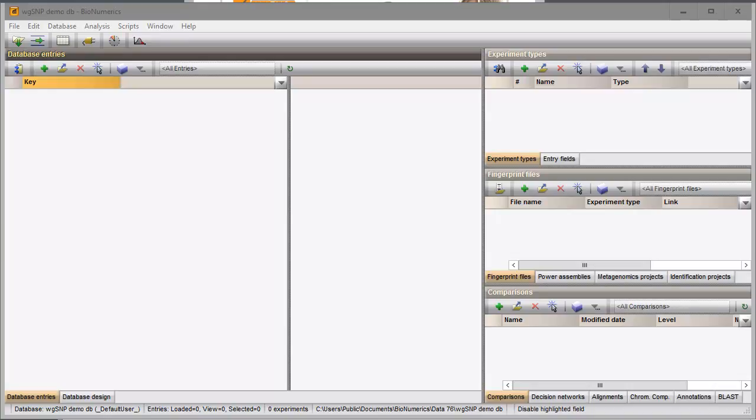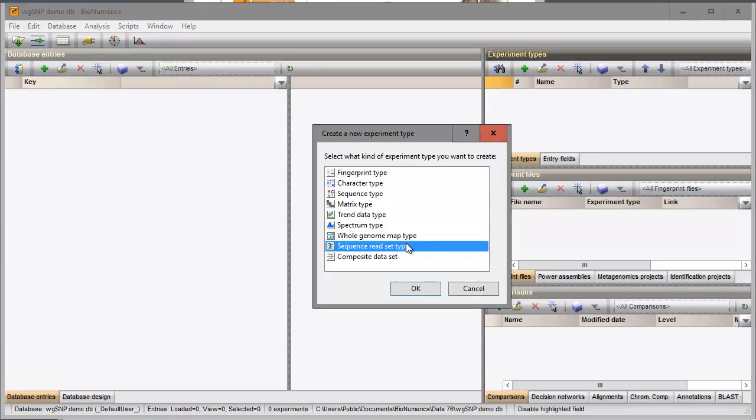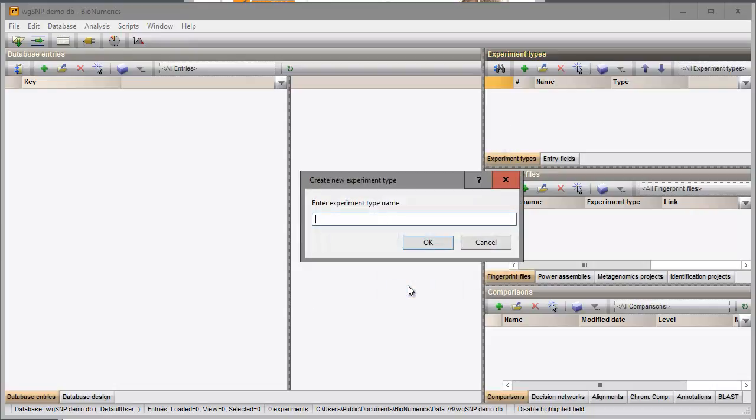First, you need to make sure a Sequence Read Set experiment is present that will hold the data. To create a new experiment, click on the green plus icon in the toolbar of the Experiment types panel and choose the Sequence Read Type option from the list. Specify a name and press OK to confirm the creation of the experiment in the database.